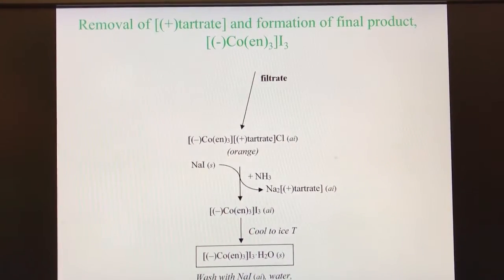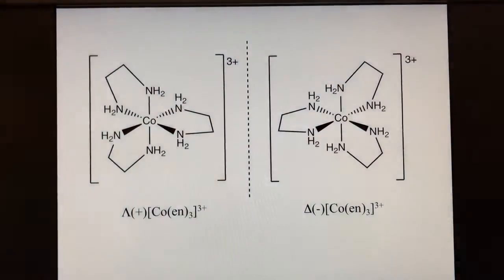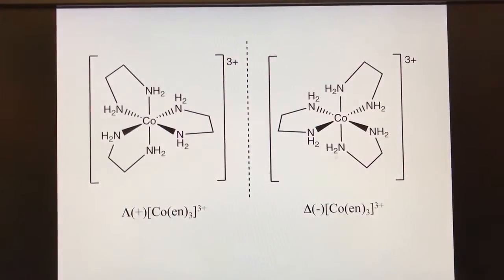And this last step with acetone really helps to dry out your crystalline product in the end, so that you can get your mass that hopefully does not have any extra water besides any that are trapped in the crystal structure.